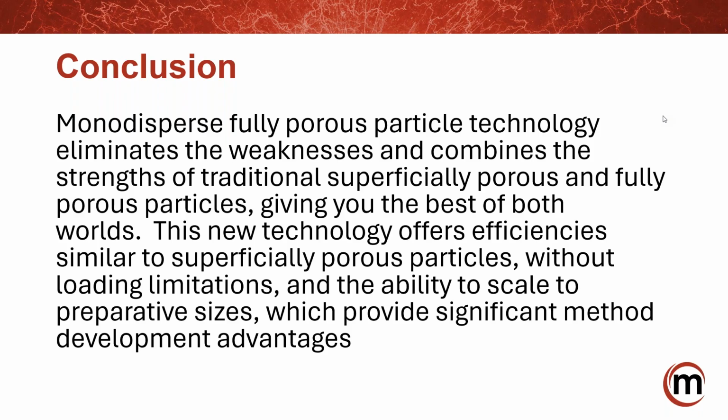Well, how easy is it? I guess it depends. The type A silicas can have a high ion exchange character. So what we would want to say is you want to start from first principles and do method scouting. We would want you to look at scouting gradients. If you wanted to actually just drop one column in for something else, it's a little bit like playing Russian roulette. It may or may not work, but we can certainly help you redevelop your method, and would love to get the opportunity to do that.